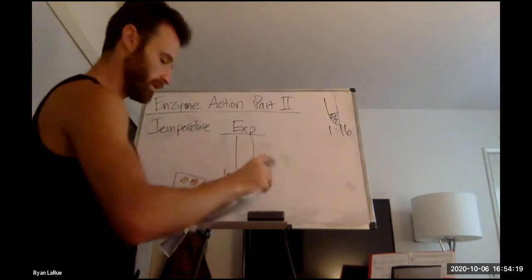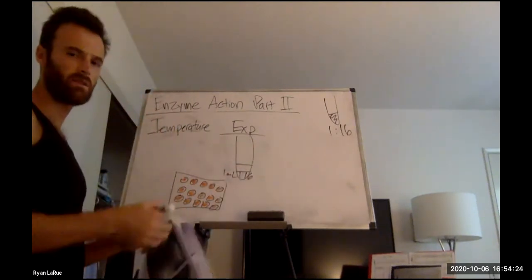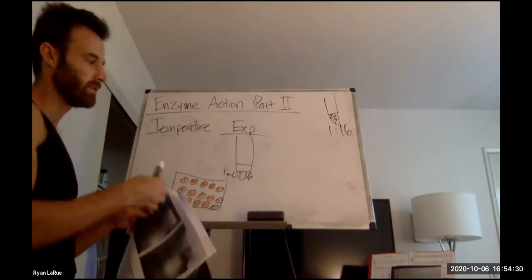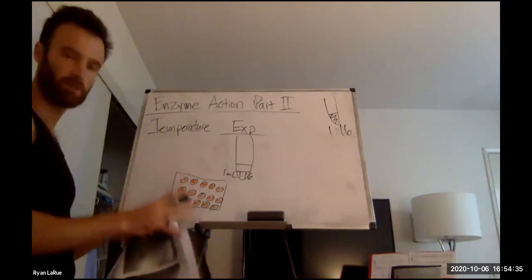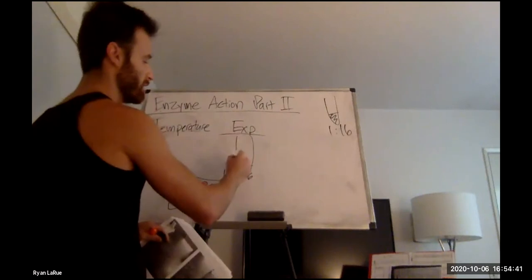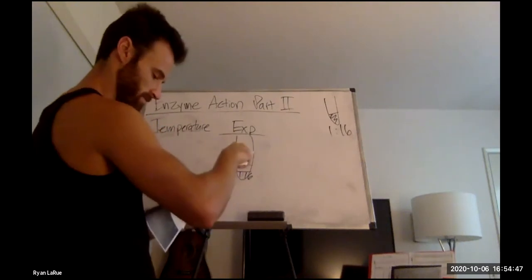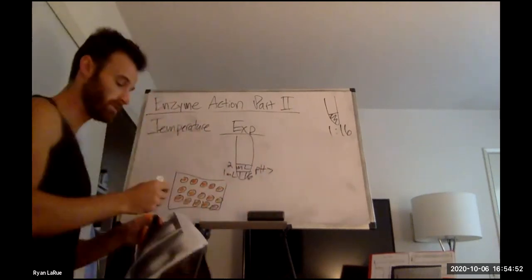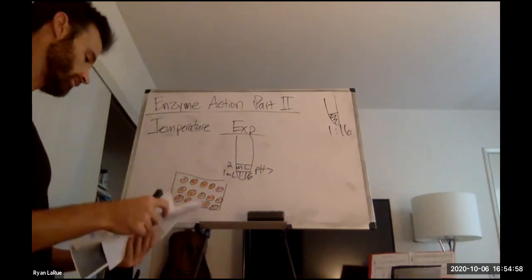And interestingly enough, you're also going to add, just to keep the only variable, right, we've learned about this with the scientific method, you want the only variable that you're testing for to be temperature, right? That's what you're looking at. So you don't want pH to influence at all. So you're actually just going to add neutral pH buffer. So this is, I think it's pH 7, right? Yeah. So you'd add 2 milliliters of neutral pH solution to your experimental test tubes for temperature.